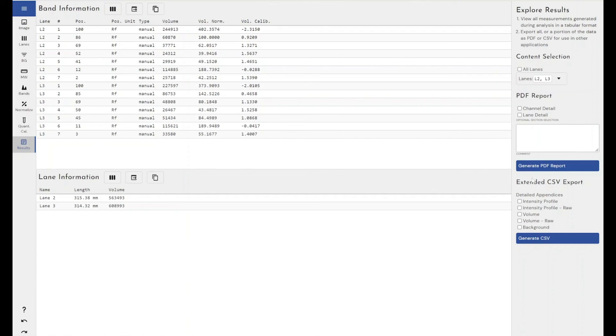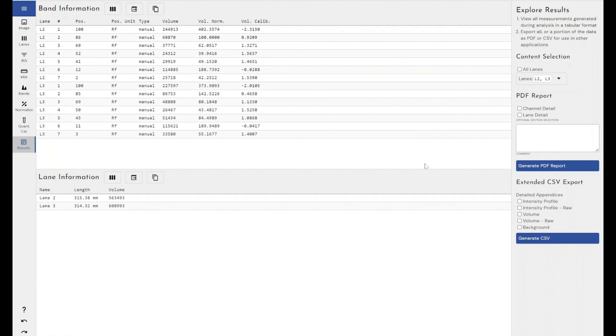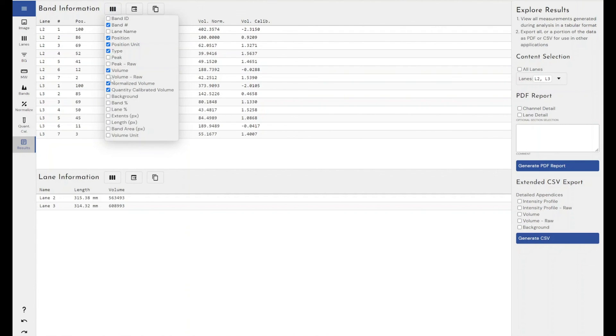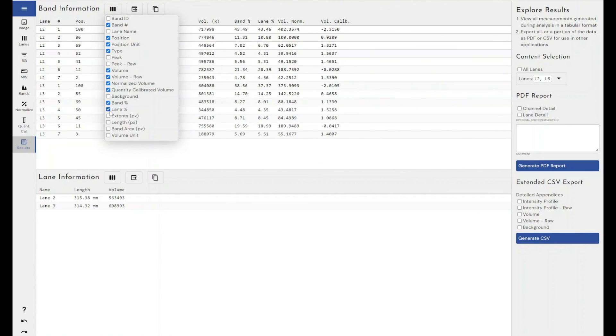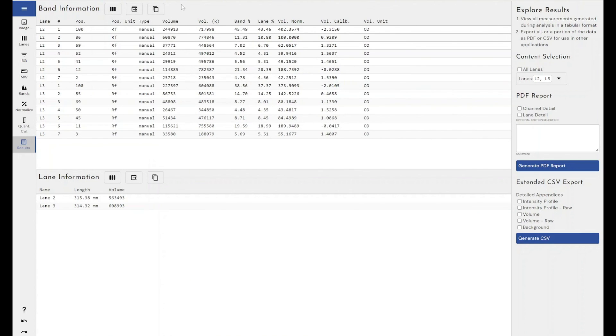You can also generate PDF reports, including images of your TLC slide and generate a proper Excel CSV file with extended data beyond what is shown in the table. So good thing to remember is everything that you've turned on here in the table, that is what will be exported. That is what will be copy and pasted. So you want to make sure that you've got everything that you want to display within this table.